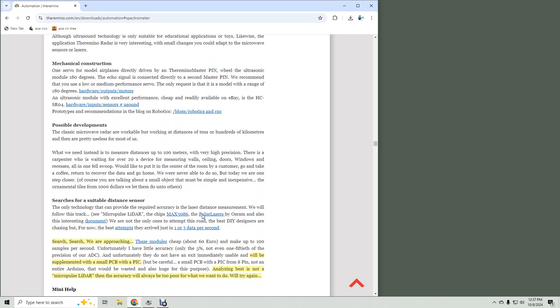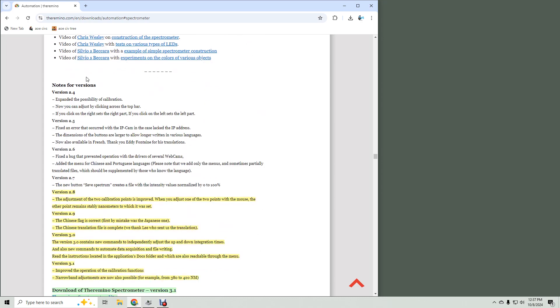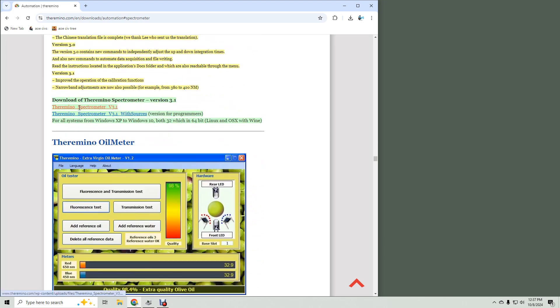Theramino is a huge suite of applications, mostly not spectroscopy, and it was hard to find the spectrometer app. Once you click on the link, note that we are halfway down a massive web page, so don't get lost. Scroll down to the descriptions of the versions and just past that is the download link with a zip file.